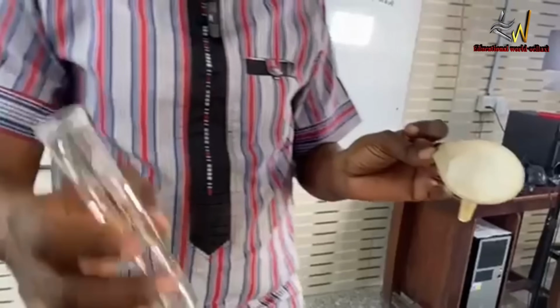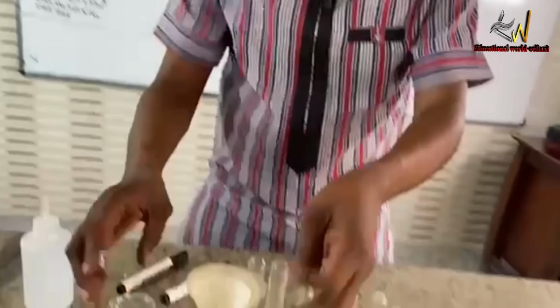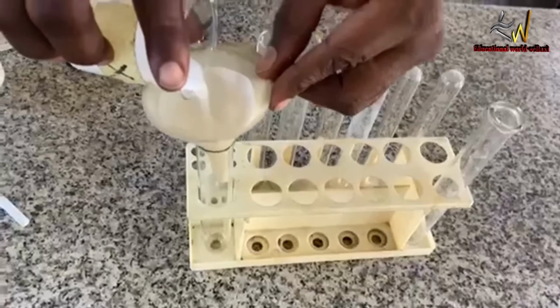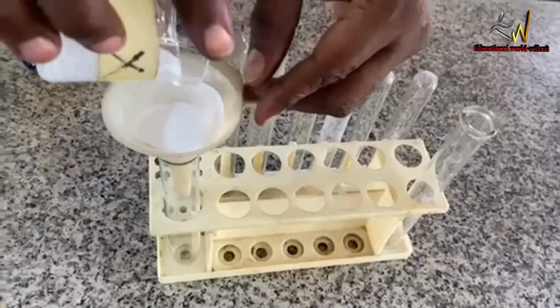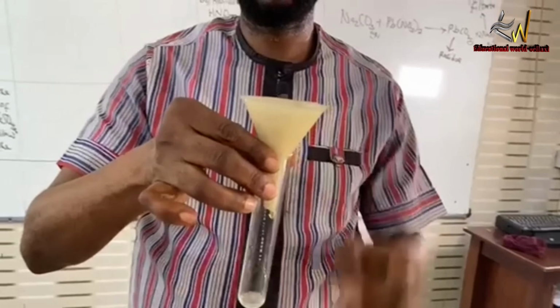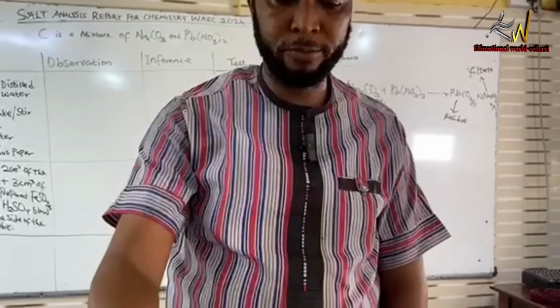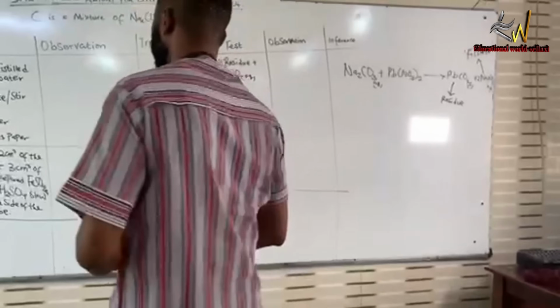So I'm filtering now. I'll pour my solution into it and filter. So it's filtering. You're getting a colorless filtrate. At the end of the day, you will get a white residue. So let me give my reports.